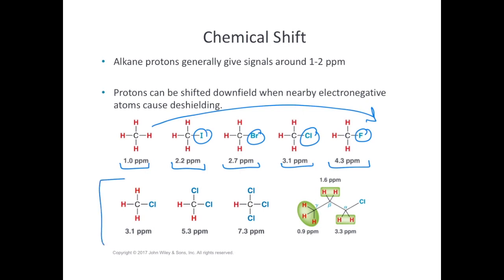If we look at this series here, we see that adding additional electronegative atoms also gives the same effect of moving the shift further downfield. In addition, the closer those hydrogens are to the electronegative atom, the more they feel that effect.